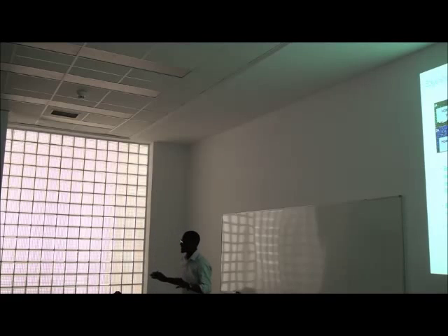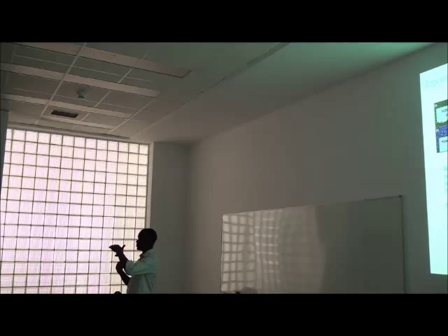It's easy to use, really easy to use. The thing is, once the protocol exists in the system, I'll show you one or two parameters that you have to change. It's usually the difference between the signal and the background. But the concept is very easy to get.